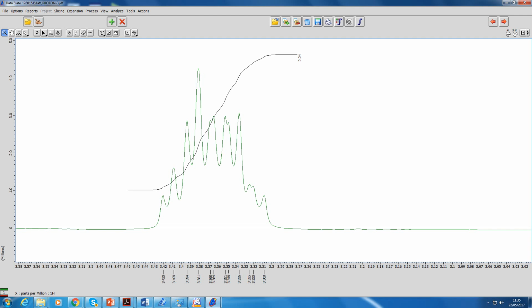Stay on this one and then hold the Alt key. Hold the Alt key. Oh yes. Maybe I've got to come off the magnifying glass. Yeah, you need the hand. Go for the hand one. The second icon. And then hold the Alt key. You should be able to drag, and then you can push up. So you can push that spectra. All I'm doing now is holding Alt. I'm pushing up with the left mouse button.